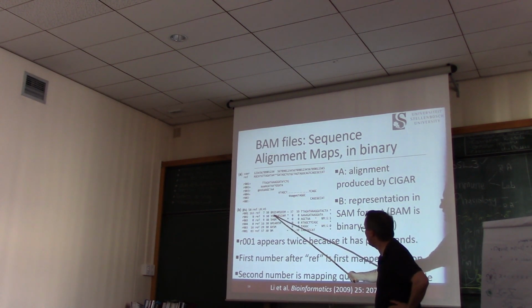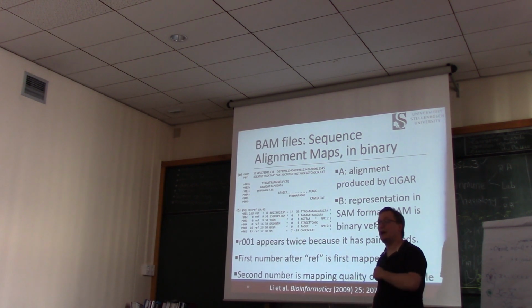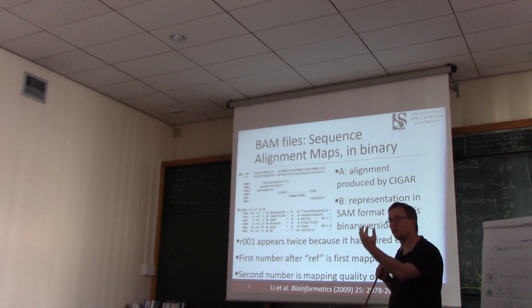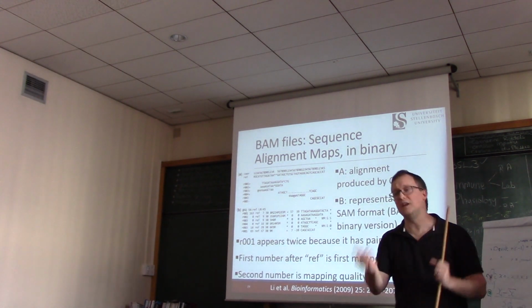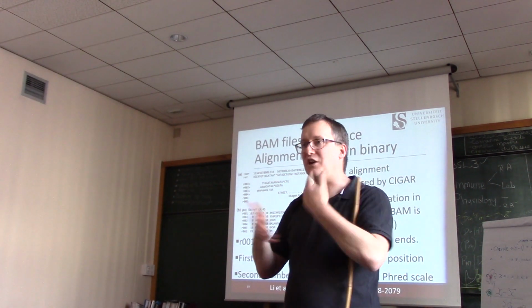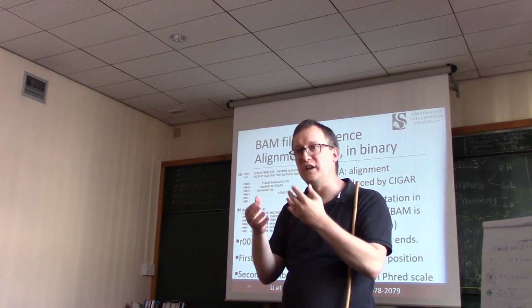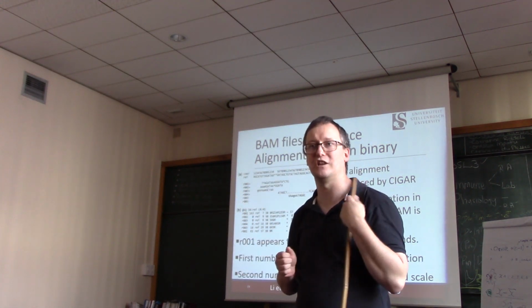The BAM or SAM file is also going to give us a map quality to say how reliable is this mapping between the sequencing read that you produced and what you see in the annotation. So a BAM file or SAM file, you can use them interchangeably really, is an explanation of how the sequencing experiment relates to the annotation that you have.